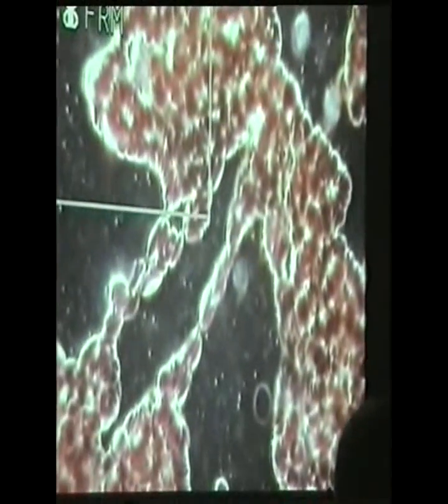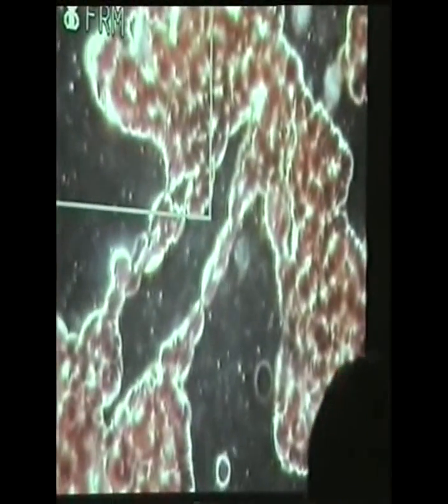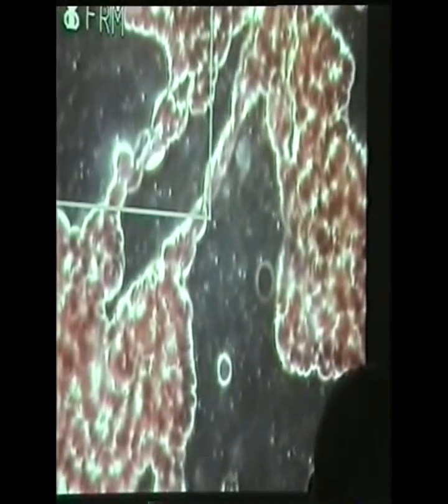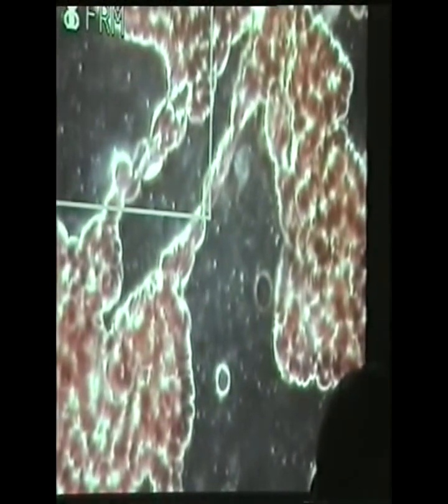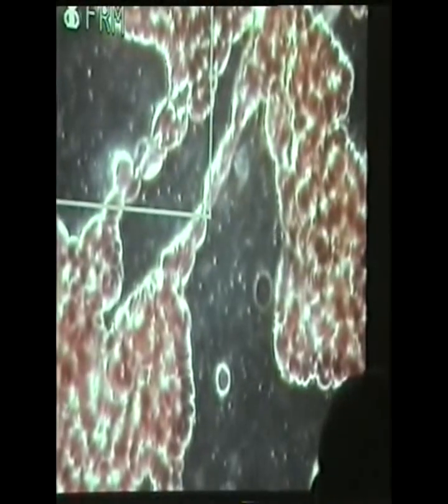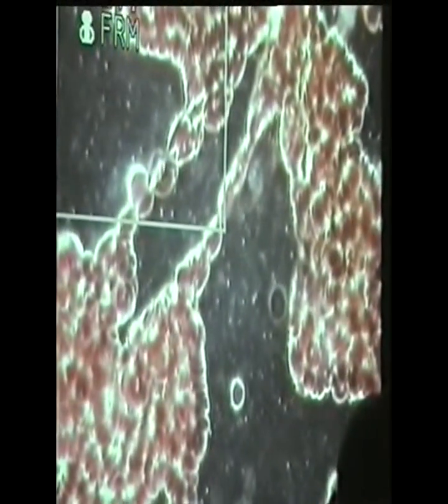The white dots are food particles that circulate freely. The lemon-shaped erythrocytes indicate that there is not enough enzymatic conversion of proteins to amino acids. The leucocyte in this picture shows little activity, both on the inside and out. This indicates a reduced performance.